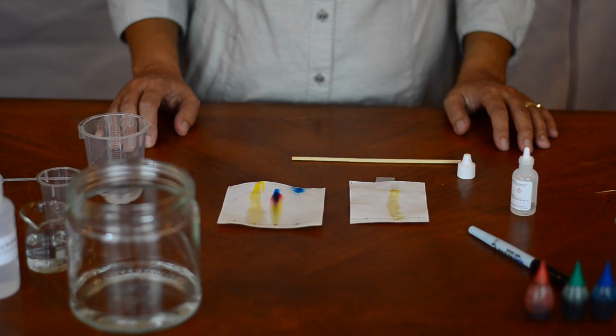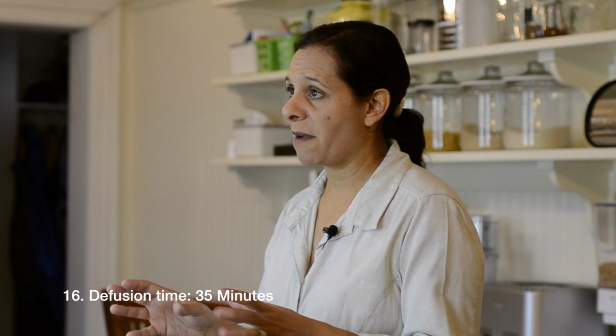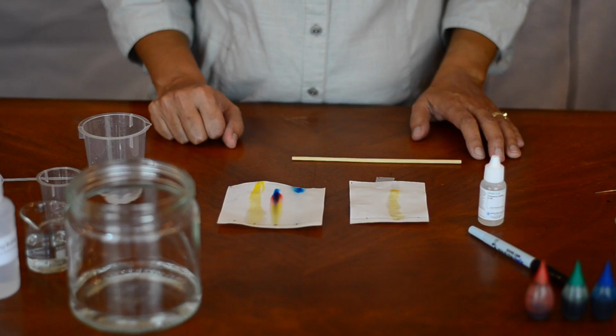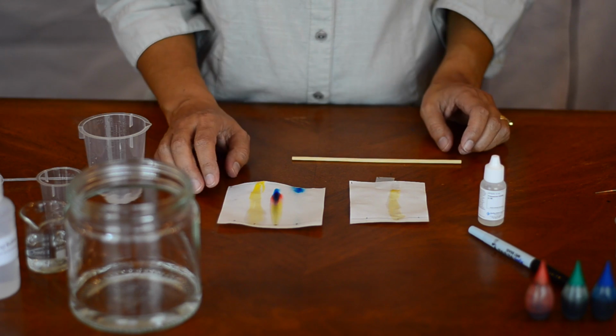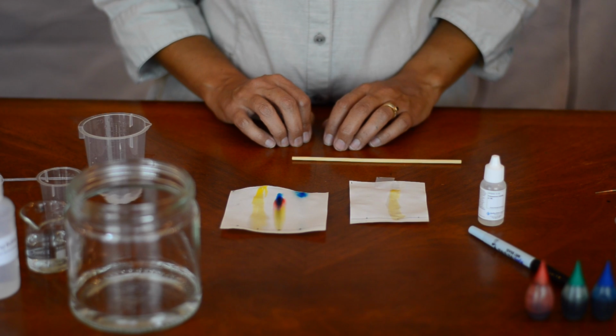So although we mix them together in a solution and put them in a well, we've now separated them on our paper chromatograph. The diffusion time was about 35 minutes, and then I did use a blow dryer to dry my papers to speed up the drying process so that I wouldn't have to wait for those papers to dry. And once the paper was dry, I was able to rub the potassium iodide to find my copper nitrate and lead nitrate. And you can see just as we're talking, the potassium iodide is drying and the copper nitrate is disappearing. I can no longer see the brown spot very well. So that's why it's important to get those observations in fairly quickly.